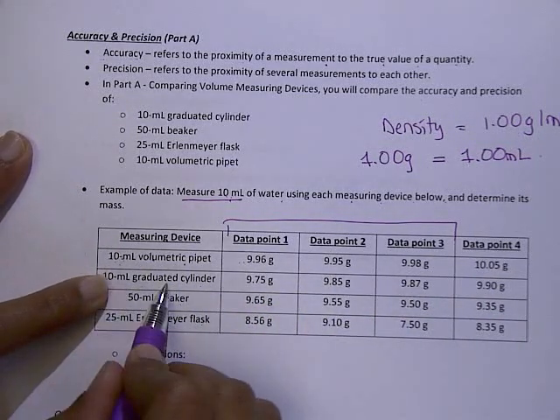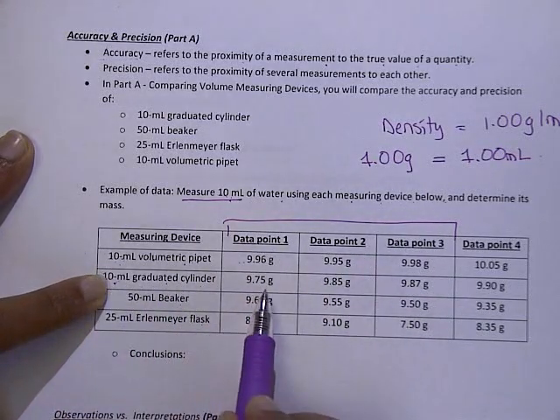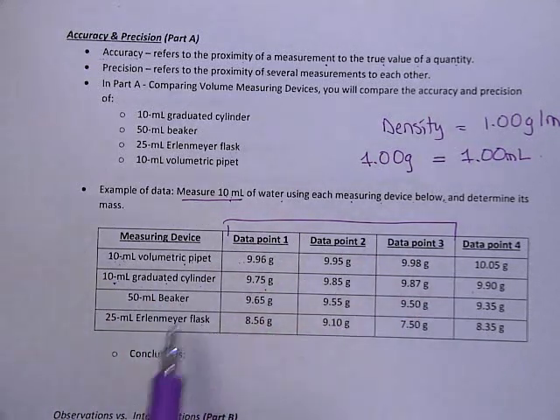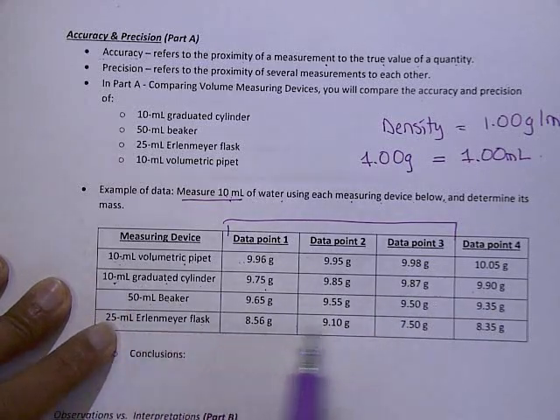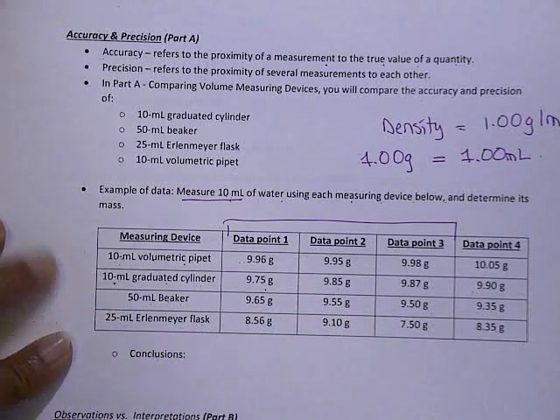So if we take a look at the 10 milliliter graduated cylinder, we measured out 10 milliliters of water as closely as possible, and then we weighed it out into a tared beaker and figured out its mass. Similarly with our 50 milliliter beaker, similarly with our 25 milliliter Erlenmeyer flask. So we can take the averages here.